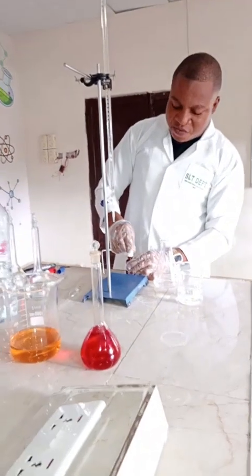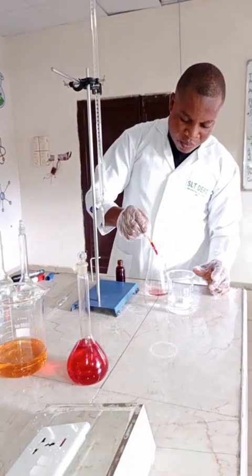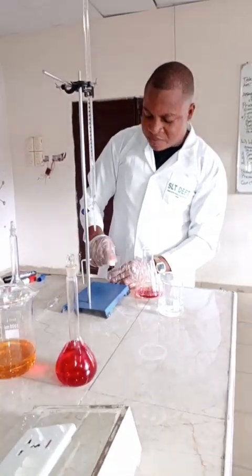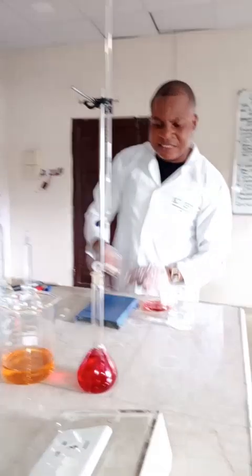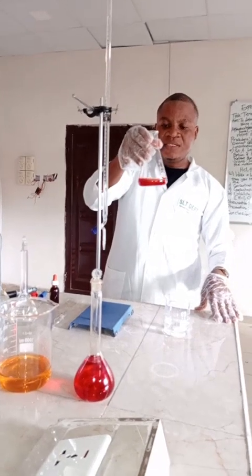two drops of the indicator, methyl red. Two drops: 1, and this is 2 of my indicator, and this is our starting point. Please note this coloration. This is our starting point.